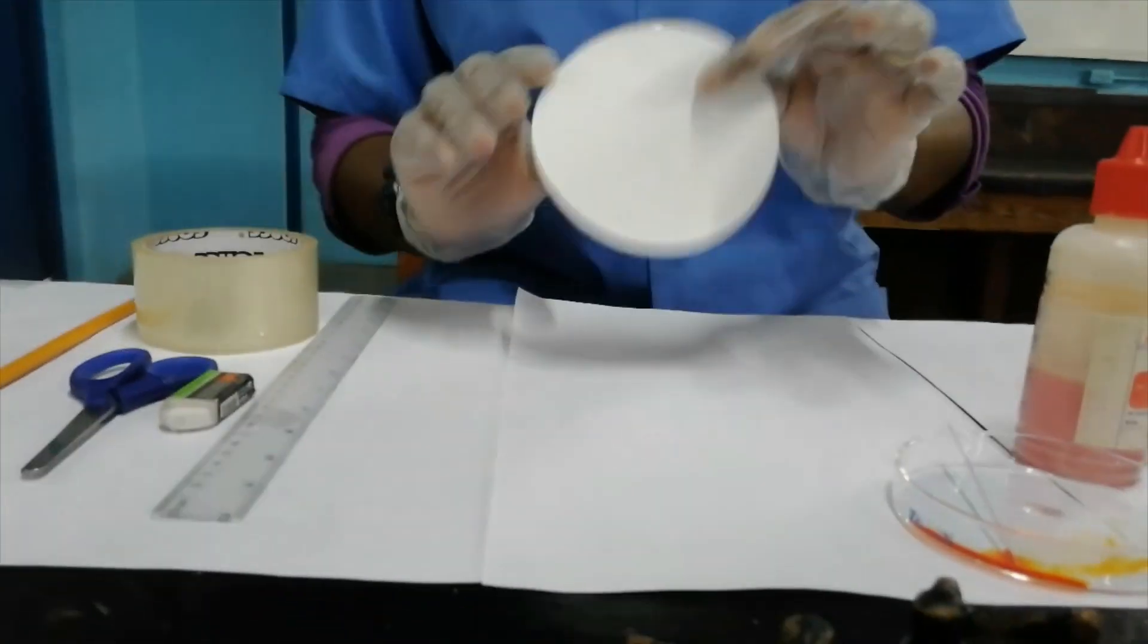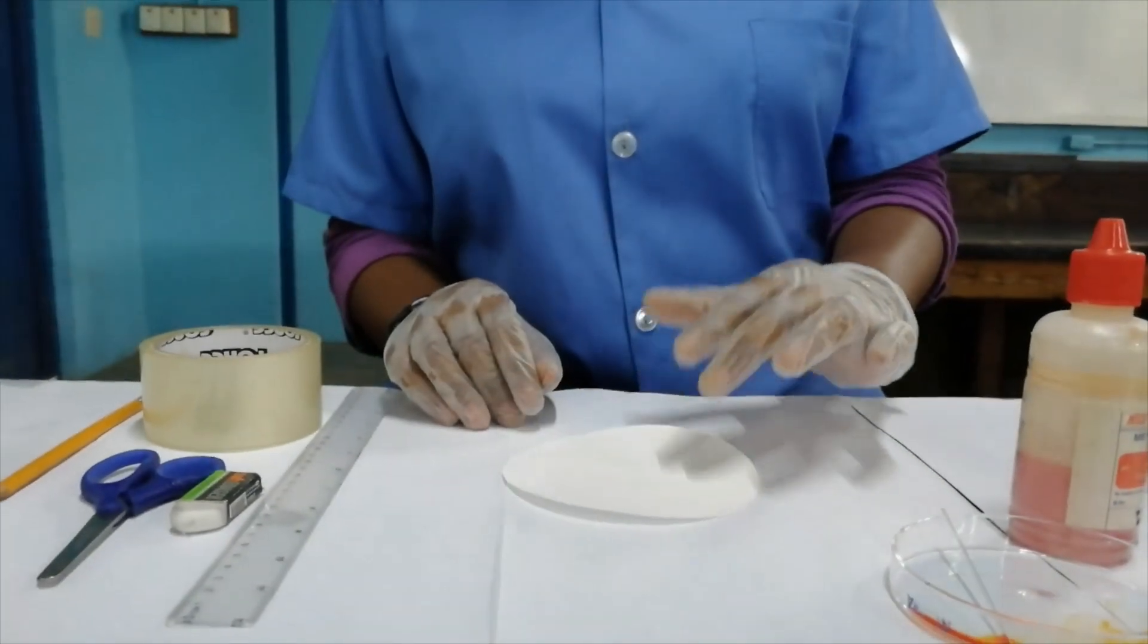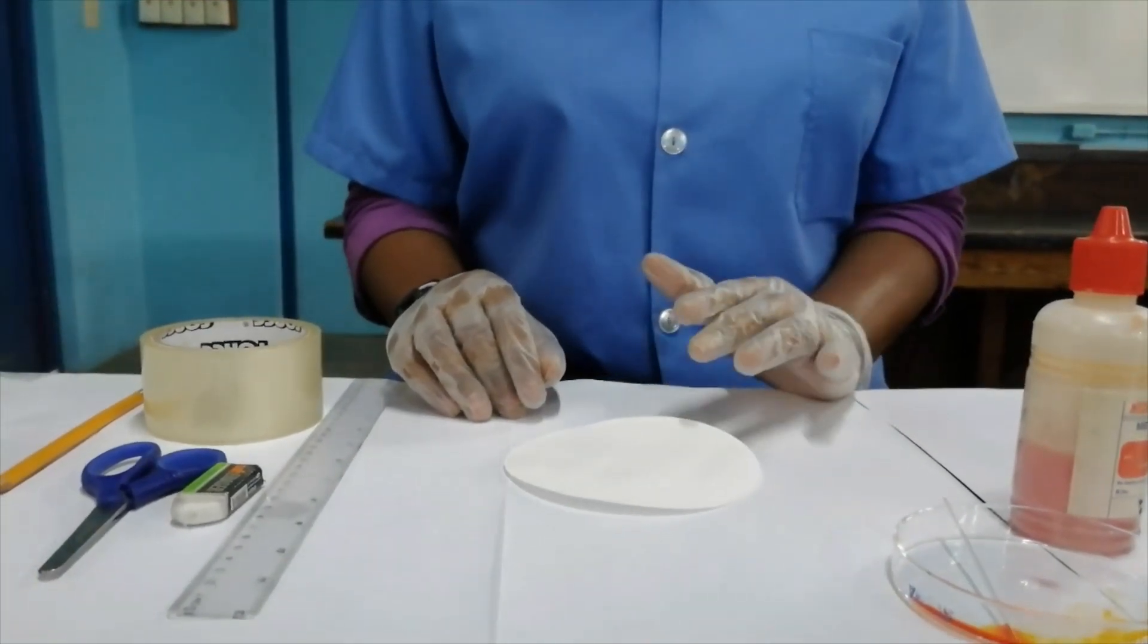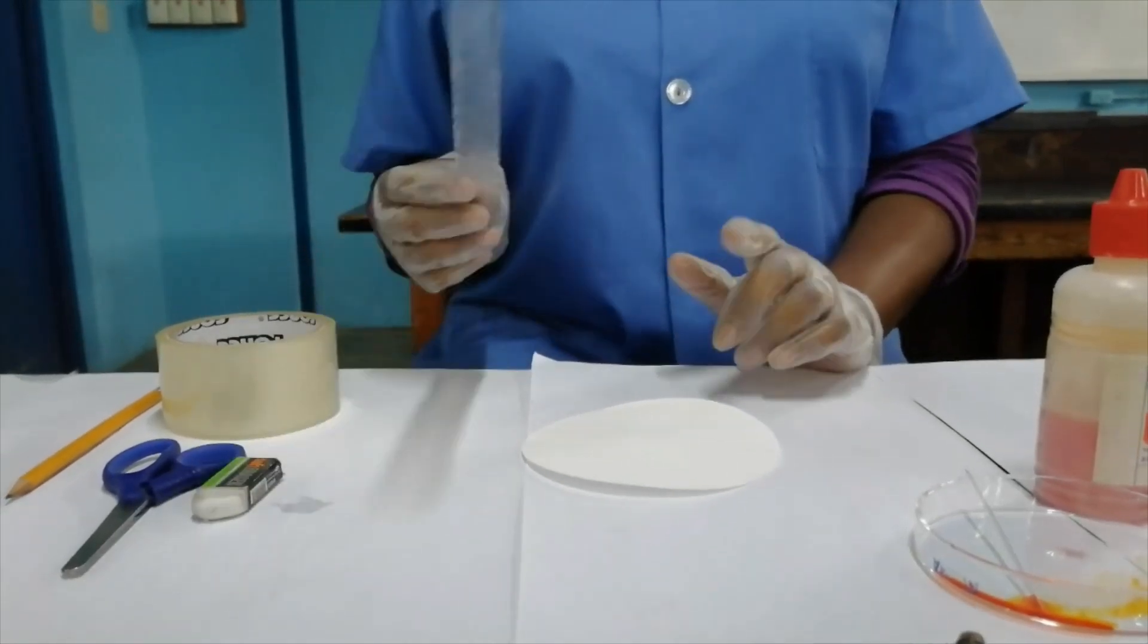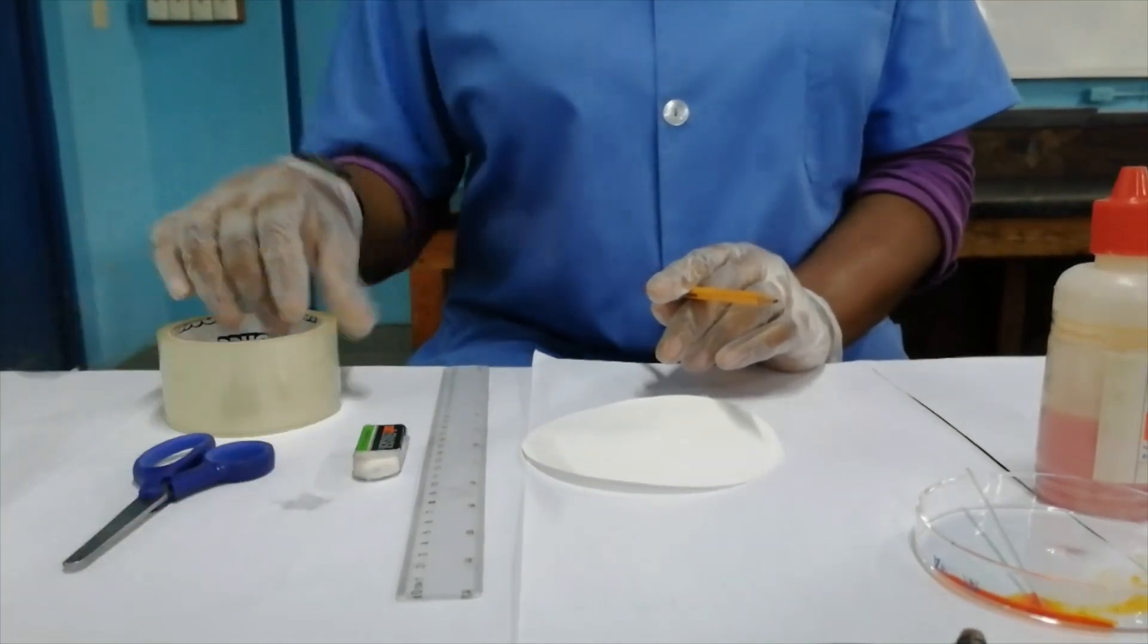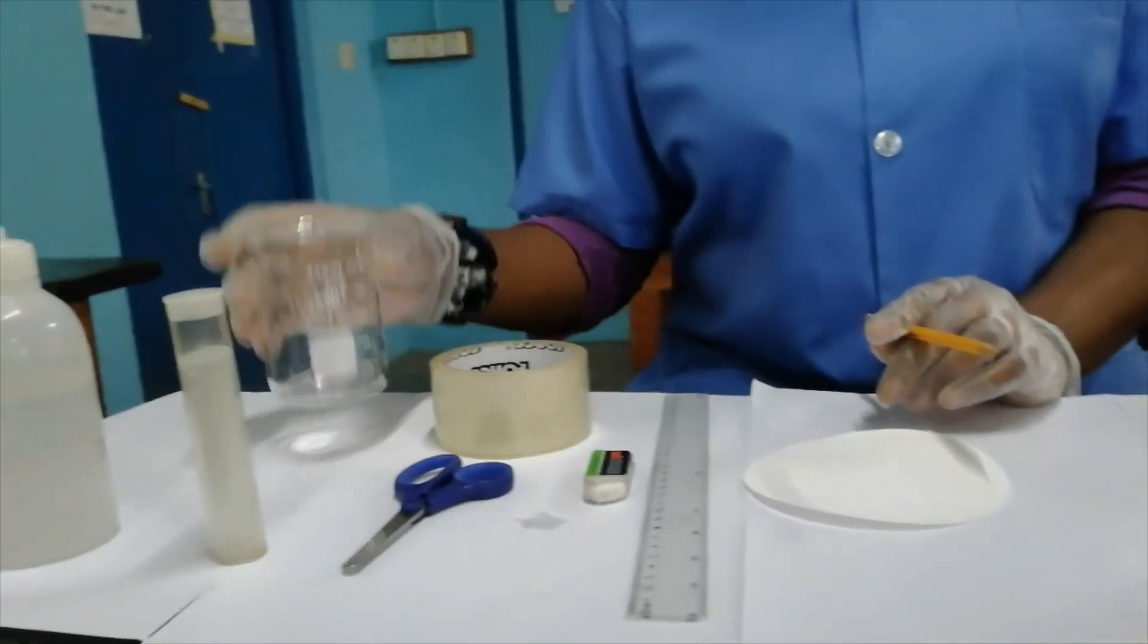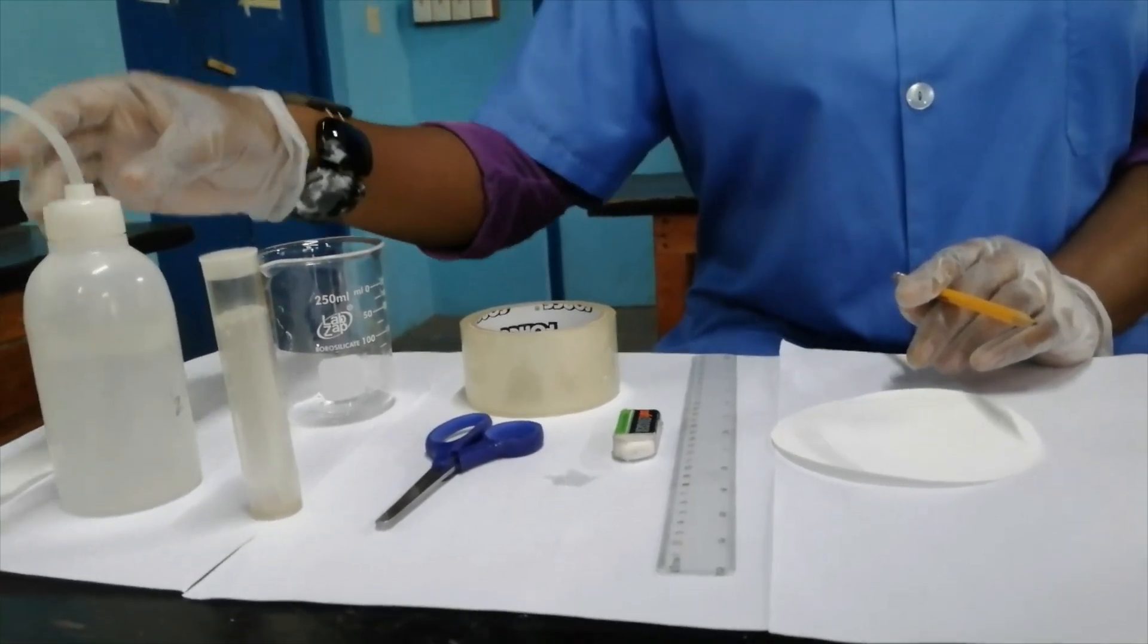We have filter paper that we're going to modify into our chromatograph, which is the instrument used to carry out the technique. We also have a ruler, pencil, eraser, scissor, tape, beaker, and water in the wash bottle which is our mobile phase.